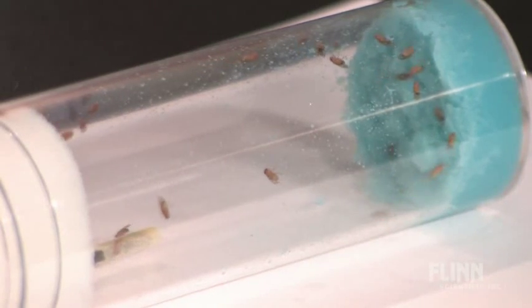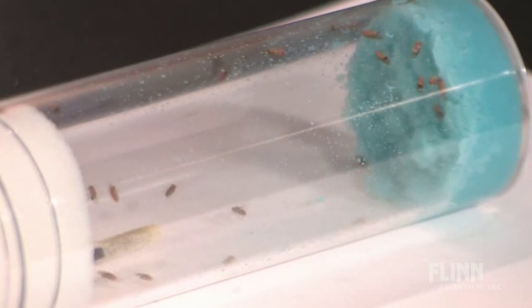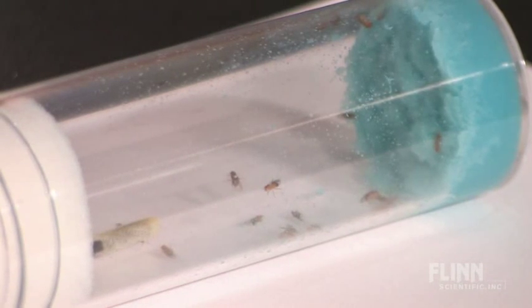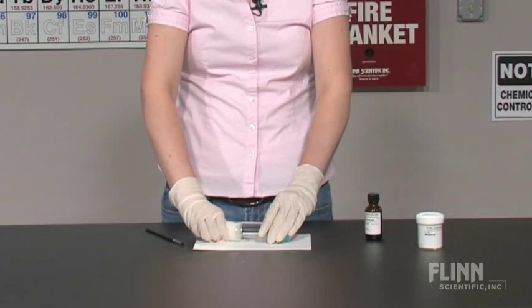Watch closely as the flies become anesthetized. This will take approximately 45 to 90 seconds. When the last fly has been anesthetized, remove the wand and the foam plug.